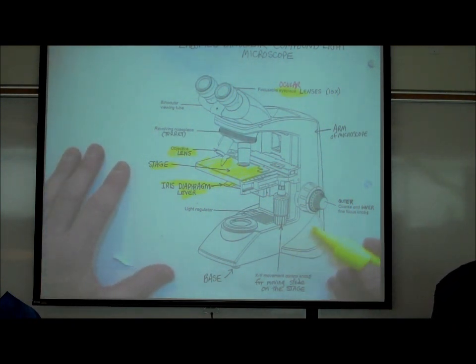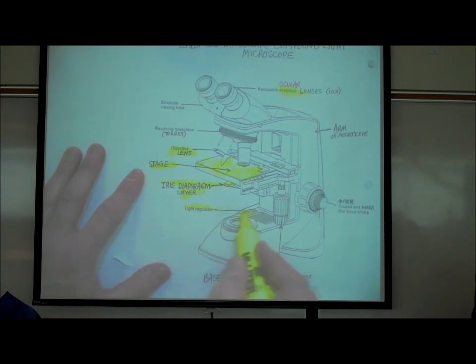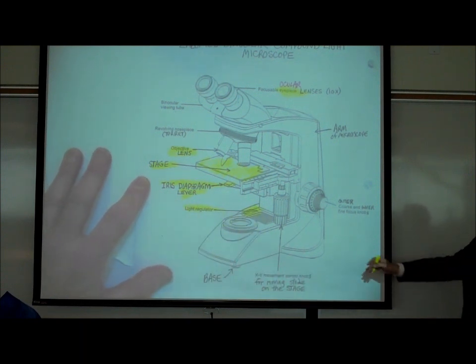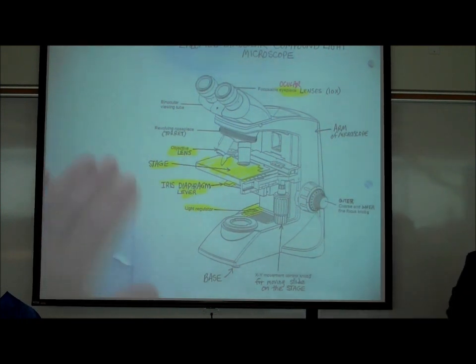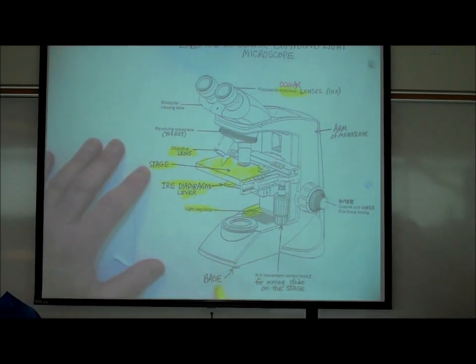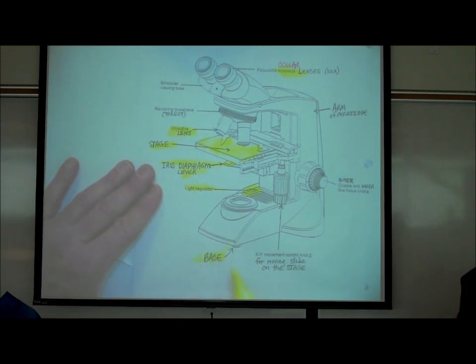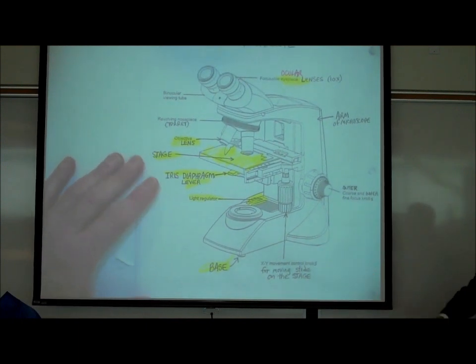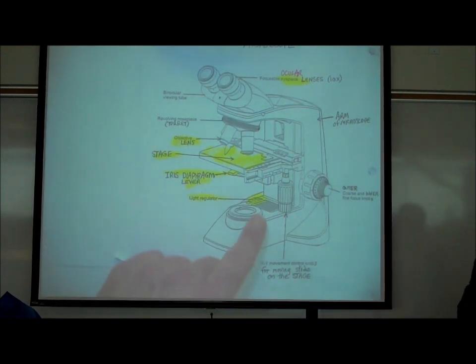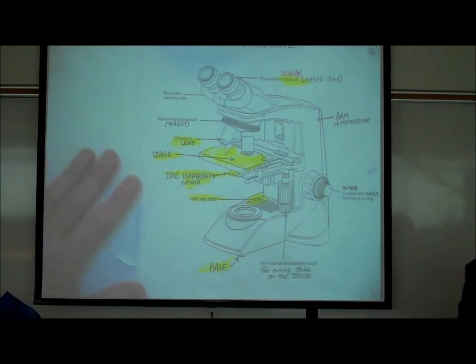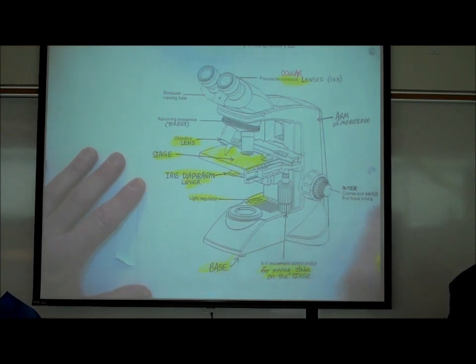There's a little knob that you can turn to make the light come on brighter or less bright. There are also knobs used to move the slide on the stage.